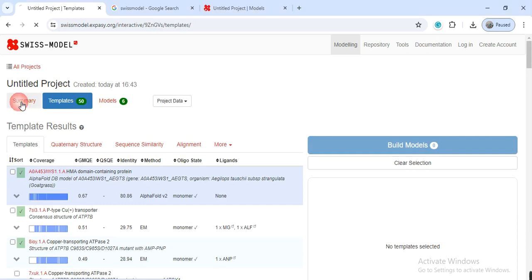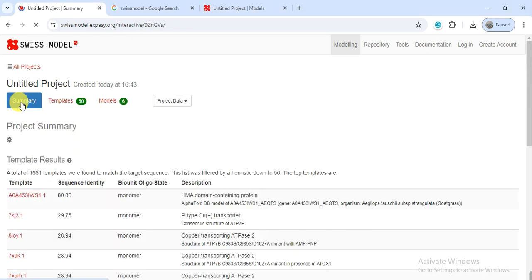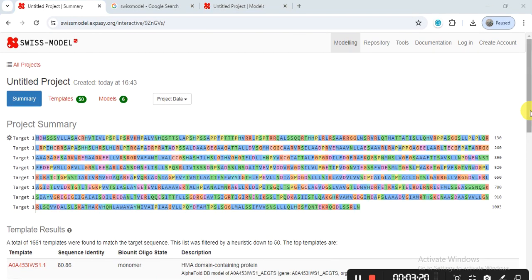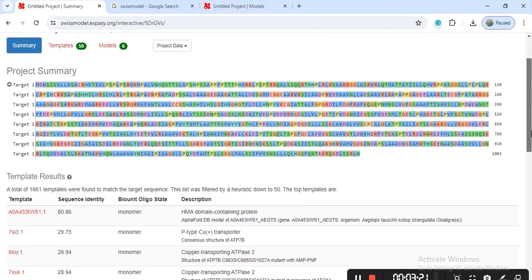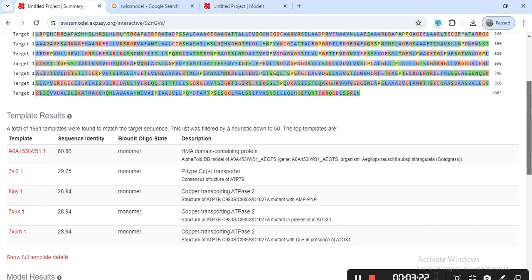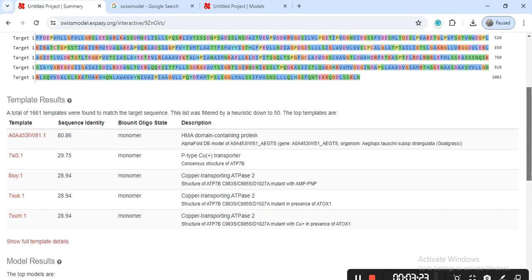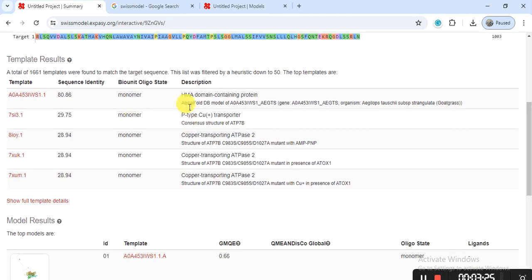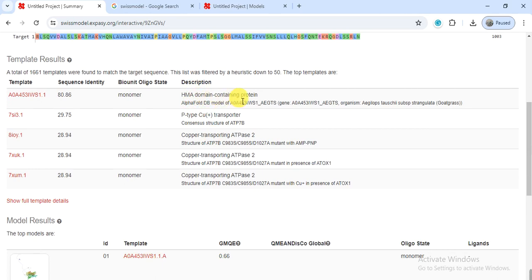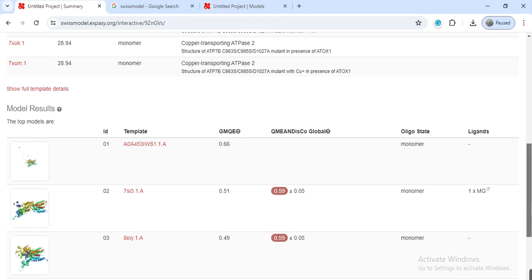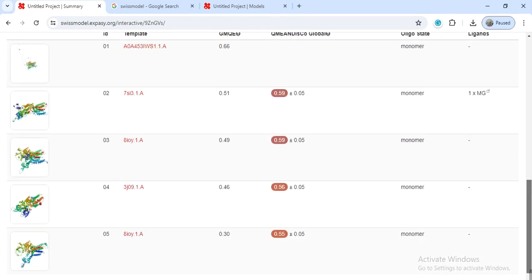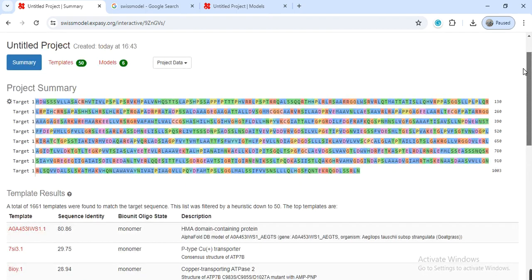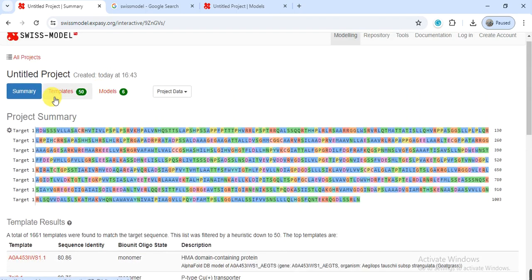First, we can check the summary of that sequence. This is our sequence and these are some targets or the information it gives that it is related to, it contains the HMA domain and some other information. These are the models and then click on template.